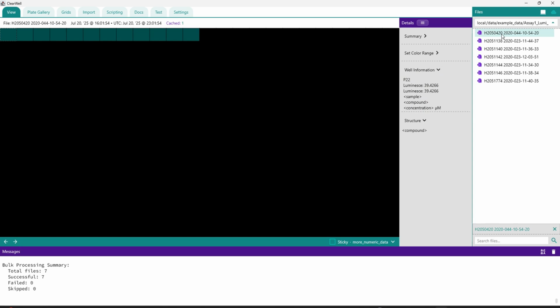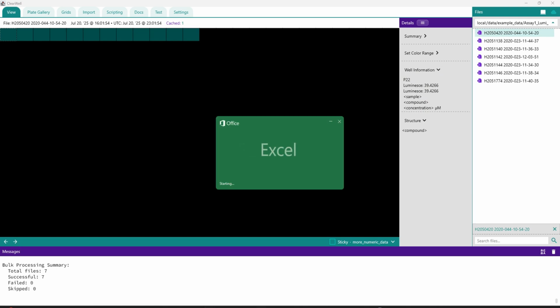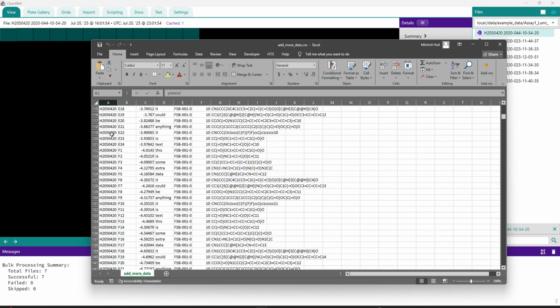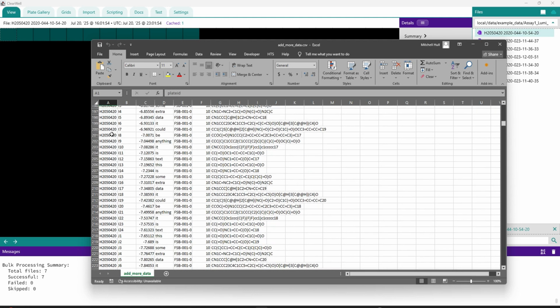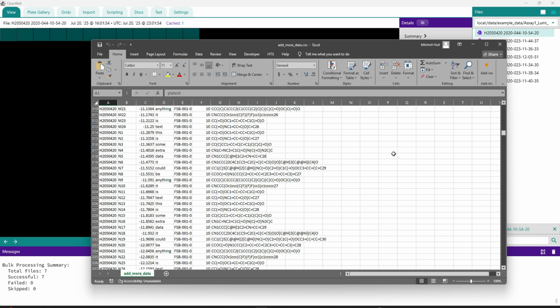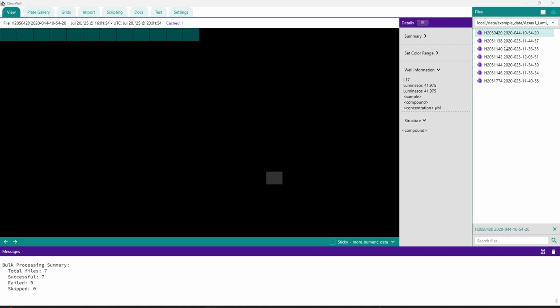Let's look at addmoredata.csv. This file contains more data for several of our plates in the SAIS Assay 1 Examples folder. You'll see this file is much larger as it contains not only several plates, but values for all the wells in those plates. Note, we've intentionally excluded some plates in this folder and a few wells on one plate to review troubleshooting. The multiple plate import is actually a bit simpler because it automatically pulls the plates and saves them as we go. But be careful. If you accidentally merge bad data, you'll need to re-import your raw instrument files in the Import tab.